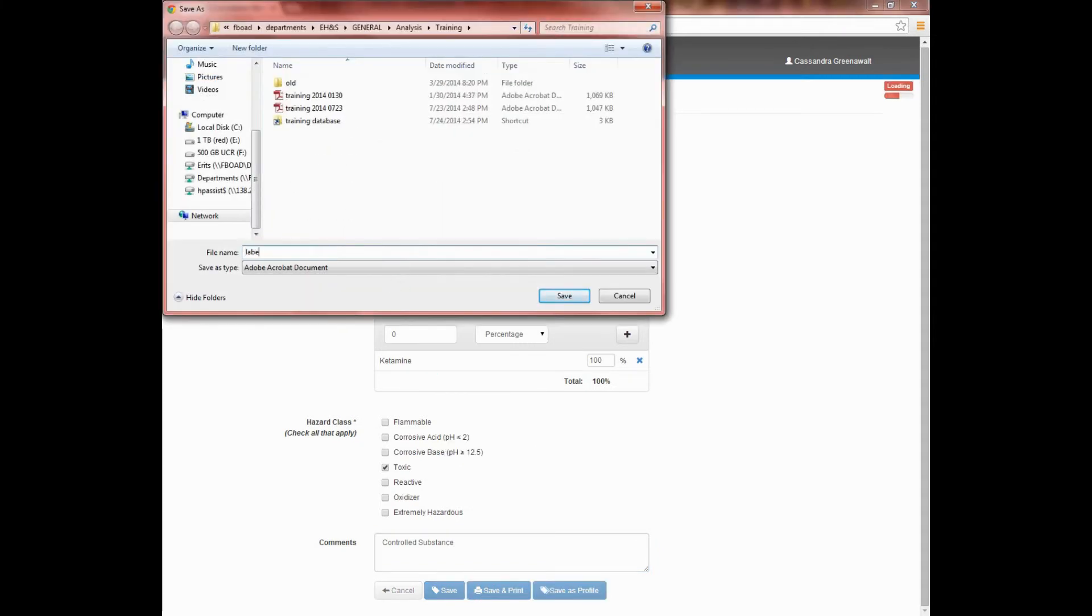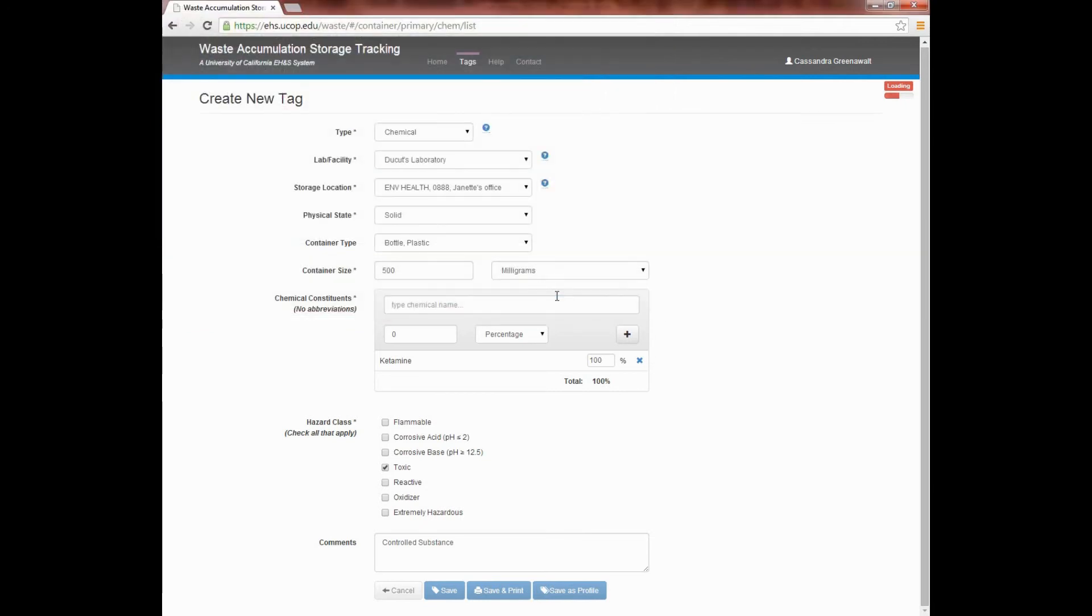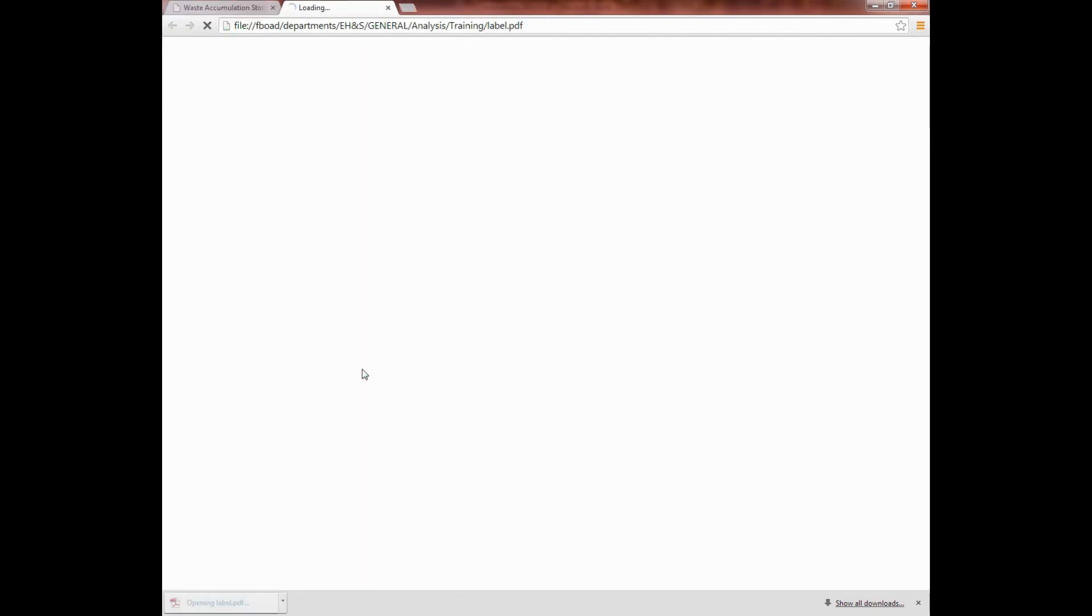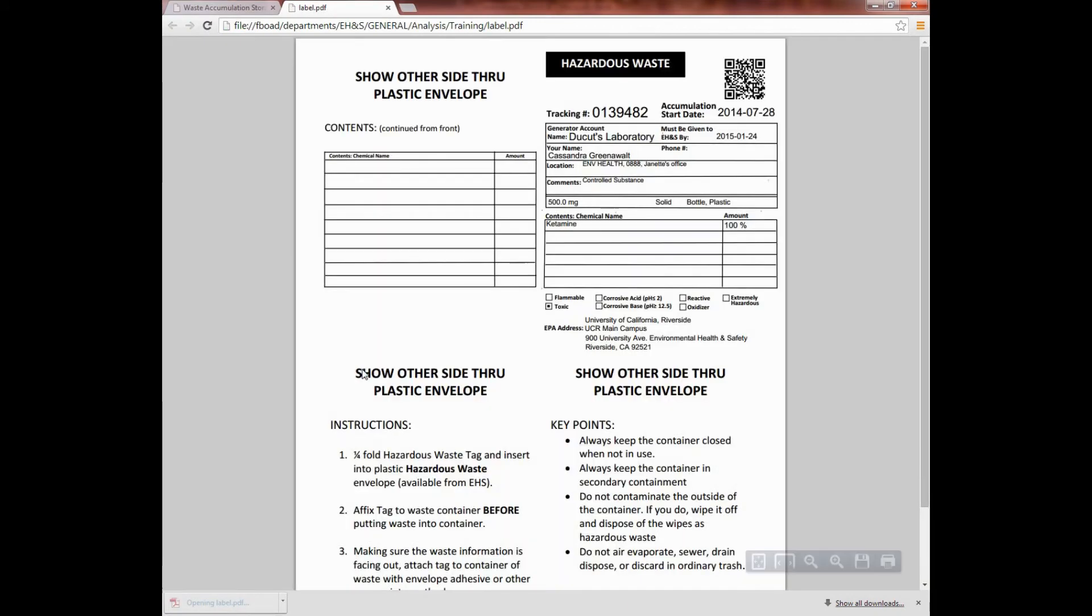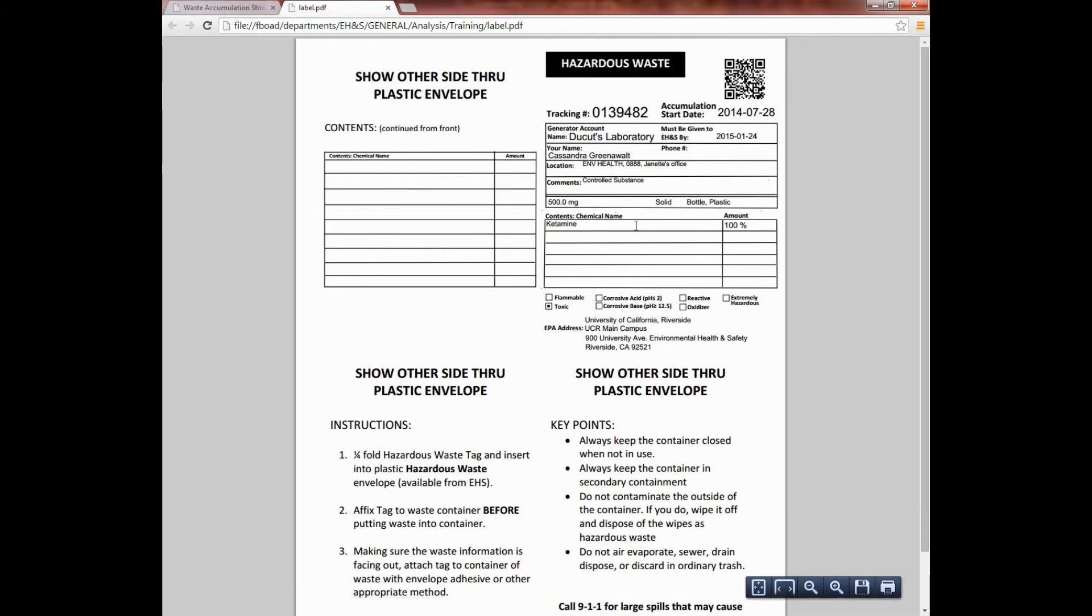From here, you can choose to either save the label or open it for printing. Verify that all the information is correct, print the tag, and then affix it to the container immediately. Pay particular attention to the chemical name and the hazard class. This label also identifies the date when the waste must be given to EH&S.